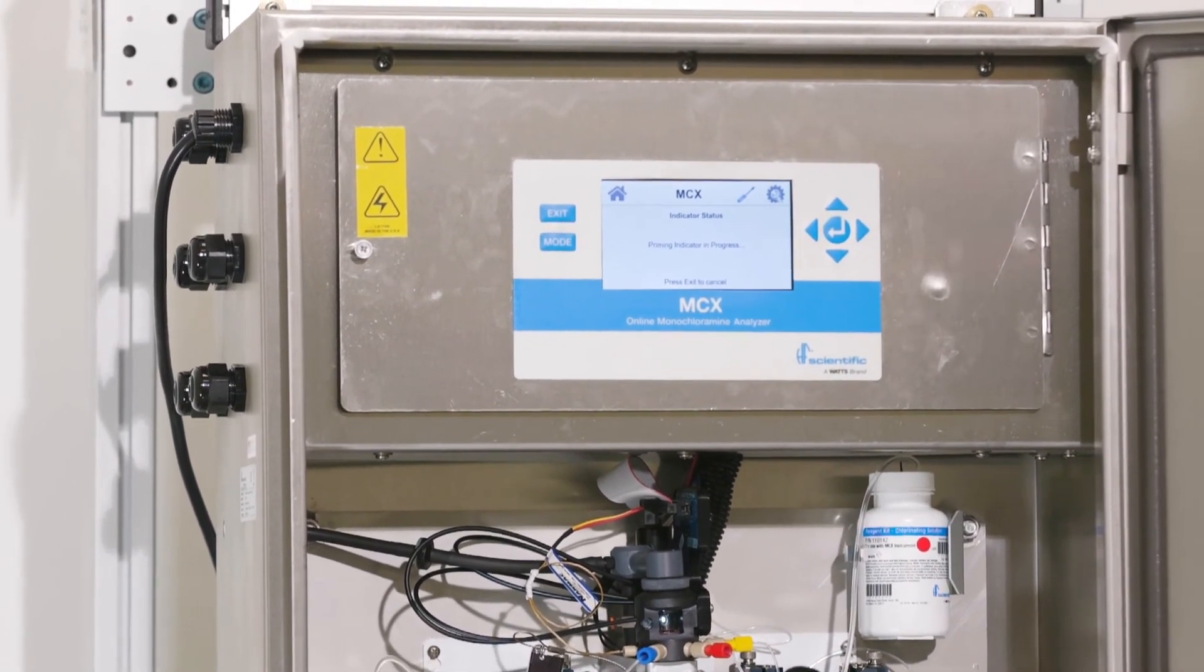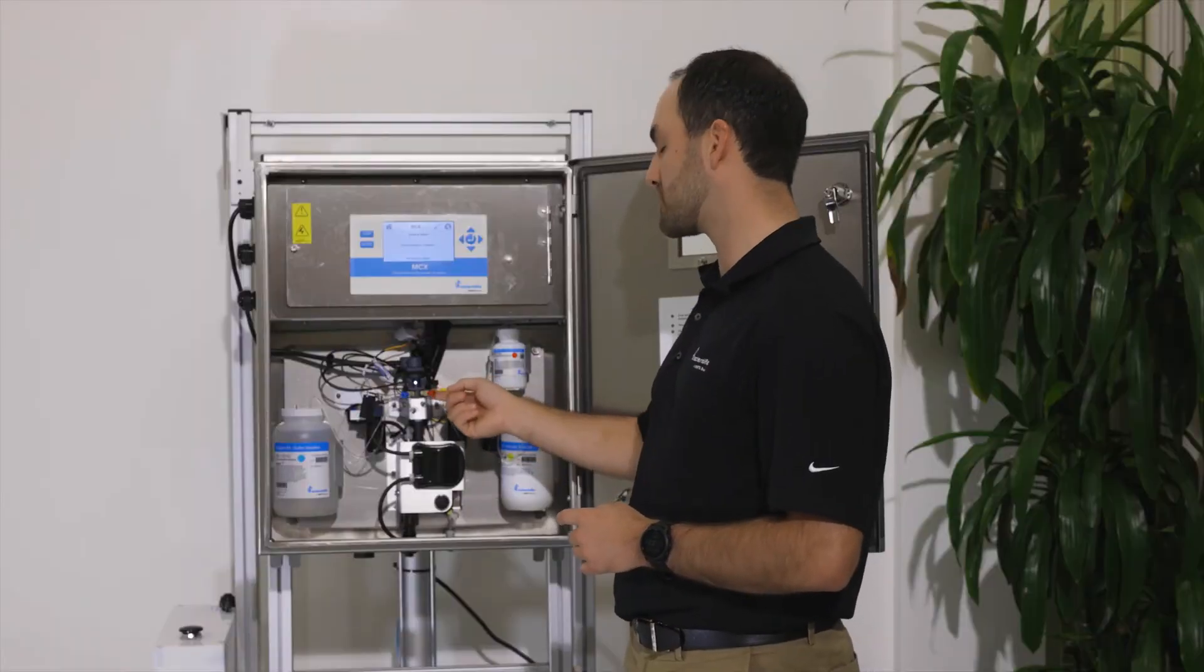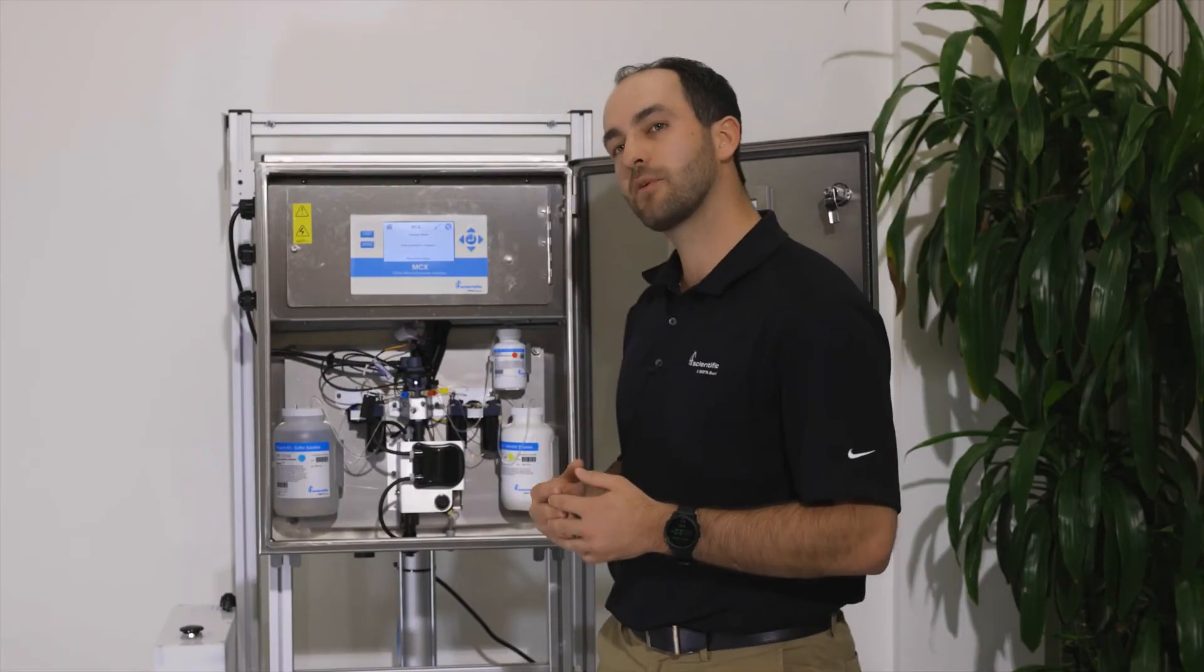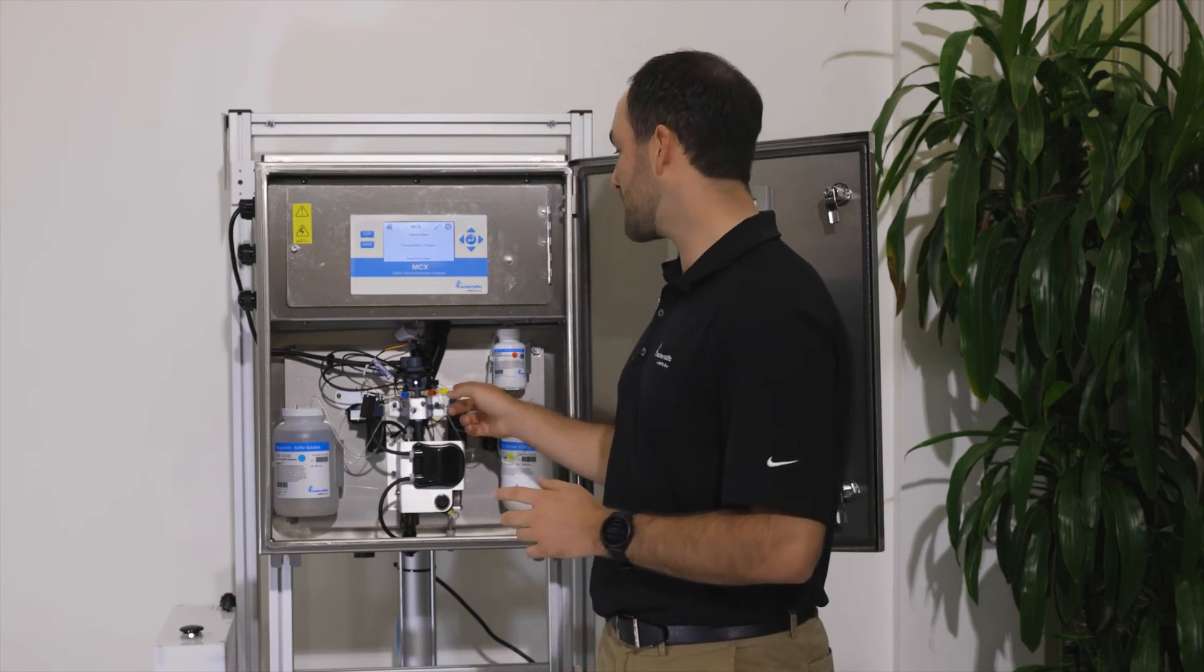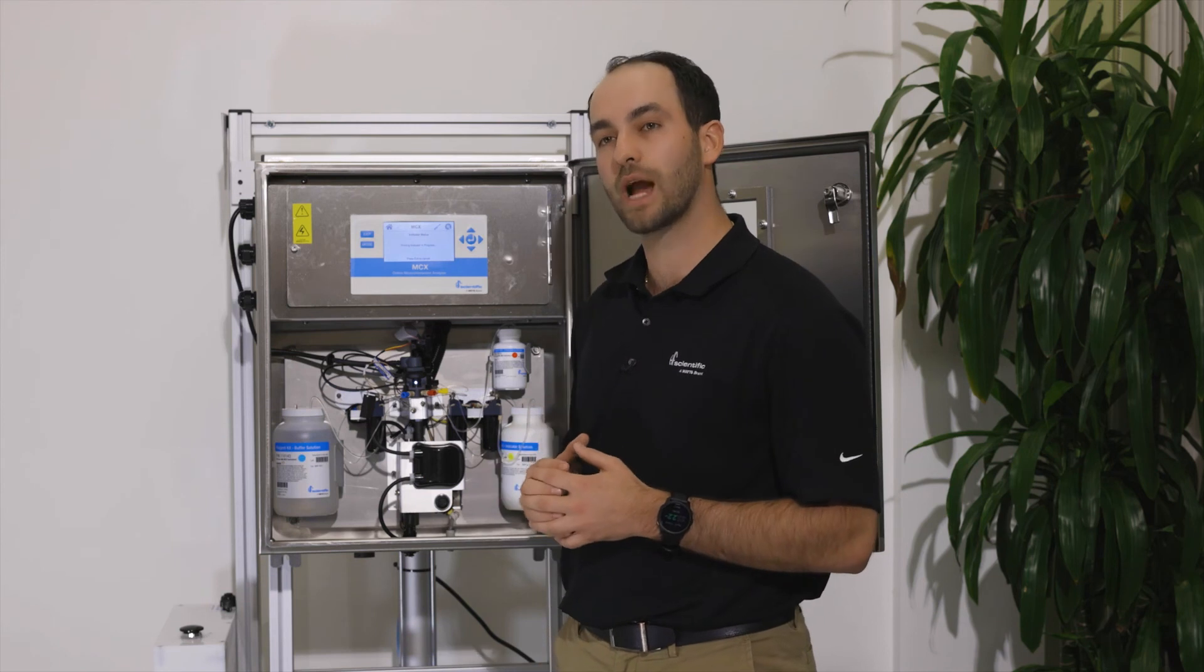When the indicator is priming, it's very easy to see as the dark color moves through the lines and into the sample cell. If at the end of the priming cycle, which is about 90 seconds, you do not see the indicator all the way into the optical block, you may need to prime the unit again.